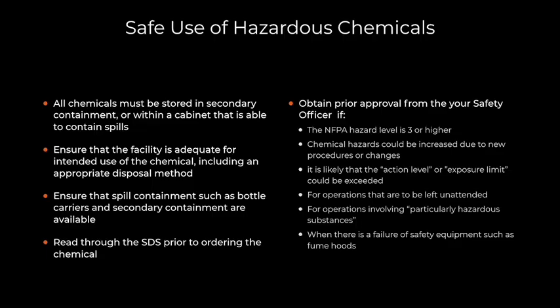Read through the SDS, safety data sheet, prior to ordering the chemical. Obtain prior approval from the safety officer before using the chemical if the NFPA hazard level is 3 or higher.